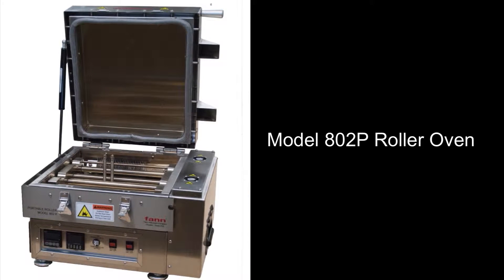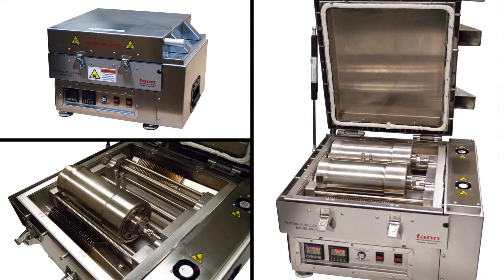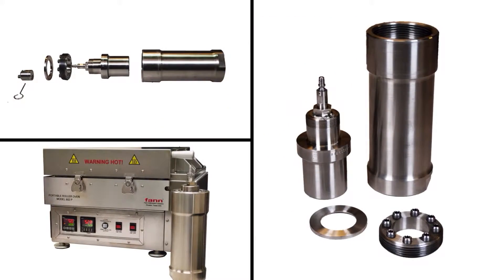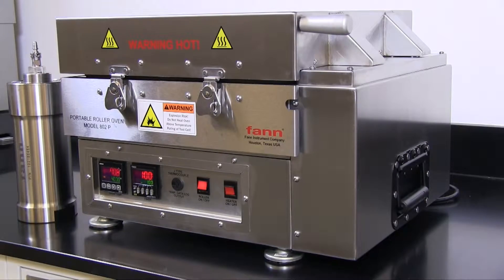This is Fan Instrument Company's model 802P 600-degree roller oven. When coupled with a 600-degree high-temperature aging cell, this oven can age drilling fluids under high-pressure and high-temperature conditions, better simulating the down-hole environment. It can do this in a compact and lightweight instrument suitable for lab or on-site use.